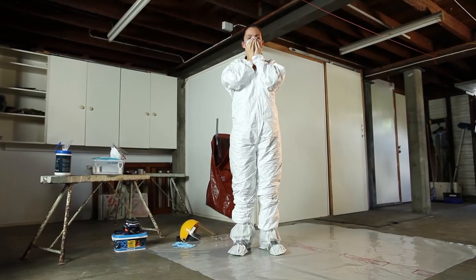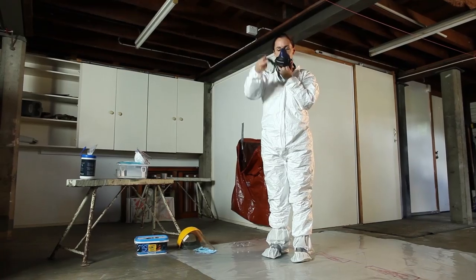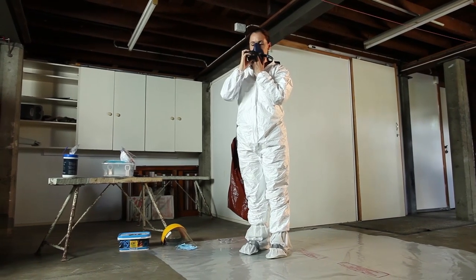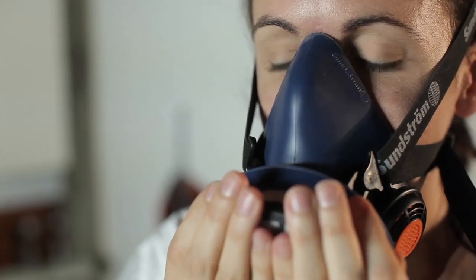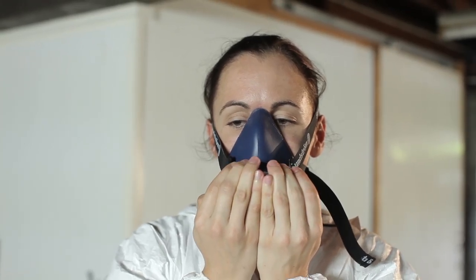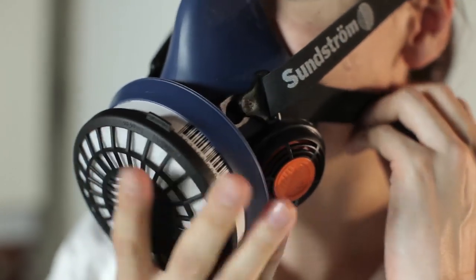Fit checking will determine if the respirator seals correctly and can be done in two ways, depending on whether your respirator has valves. If you are using a disposable respirator and it does not have a valve, place your hands over the respirator and breathe out hard. If the seal isn't good, you'll feel air leaking out from the edges of the mask. If you are using a reusable respirator that does have a valve or cartridge, or a disposable respirator that has a valve, place a hand over each cartridge or on the valve and take a quick deep breath in. If it is well sealed, the respirator will collapse slightly inwards and you won't feel any air passing between it and your face. Any detected air leaks should be corrected by repositioning the respirator and checking again.